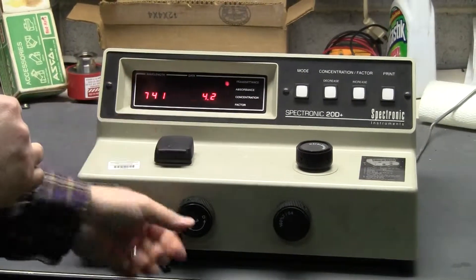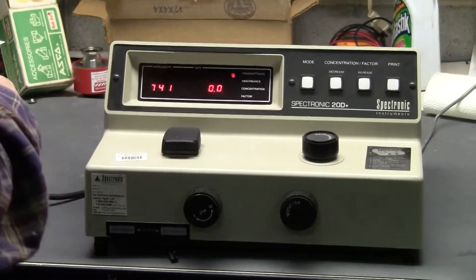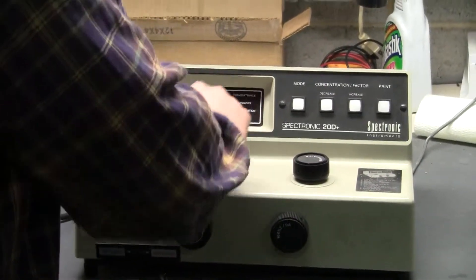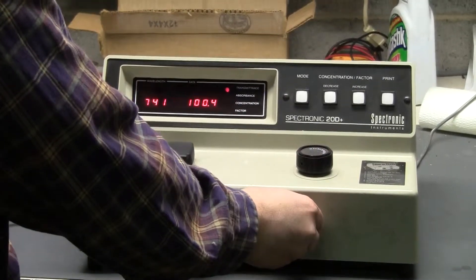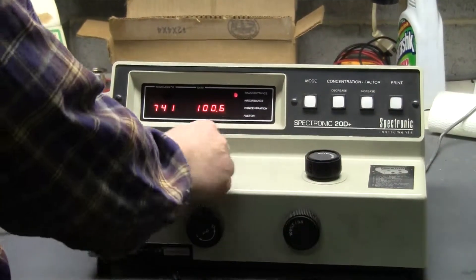This unit, we're going to zero it out real quick. Perfect. We're going to insert our blank, making sure it's 100% transmittance. Close enough.